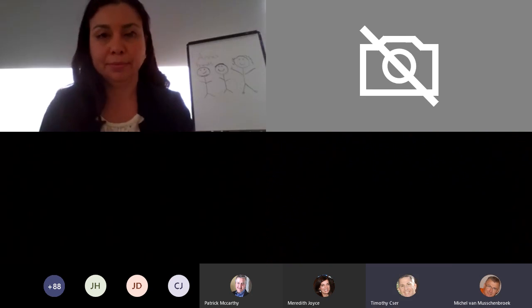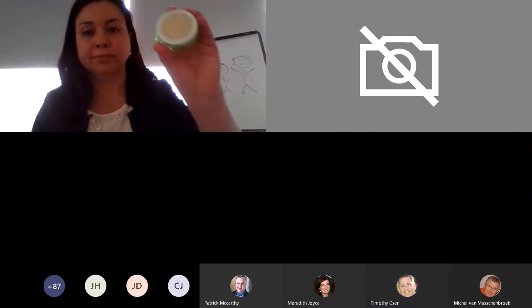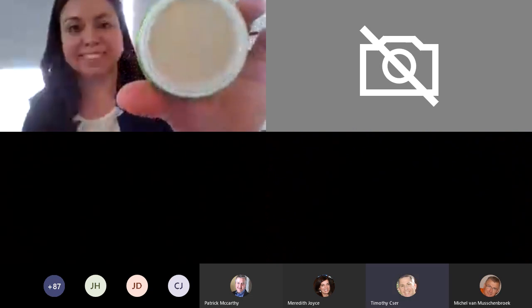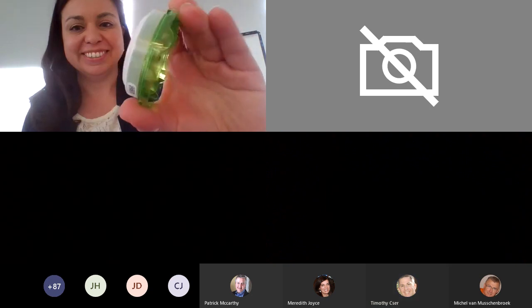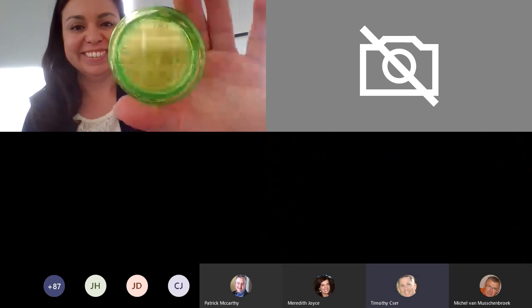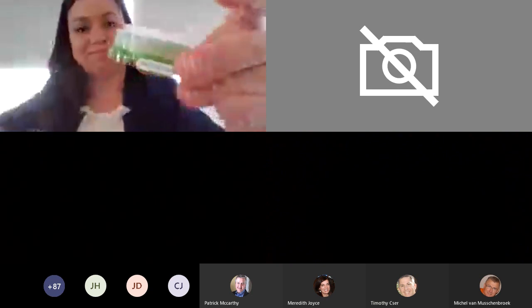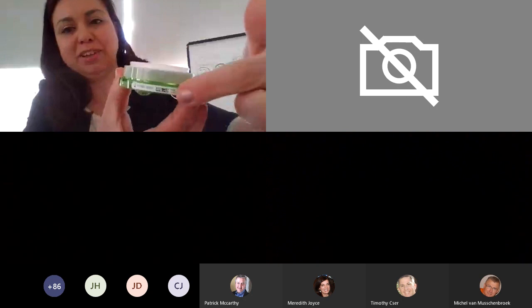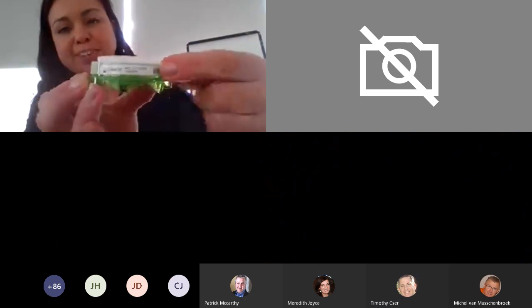Can you show the membrane on top of the media a little bit closer? Turn it over so that people can see what it looks like. I didn't line up my labels very well, but there's the label on the cassette and the label that was left behind on the filtration unit.